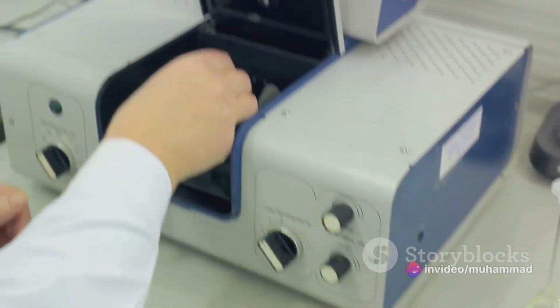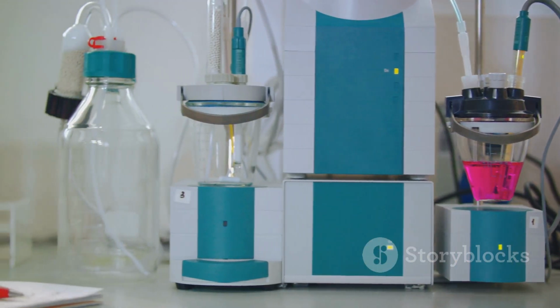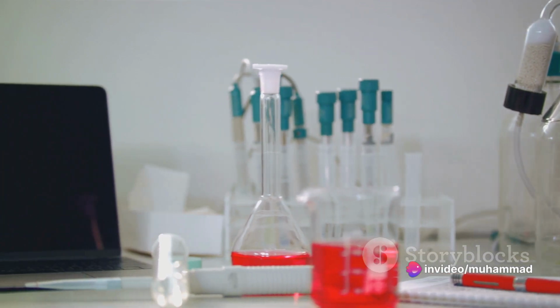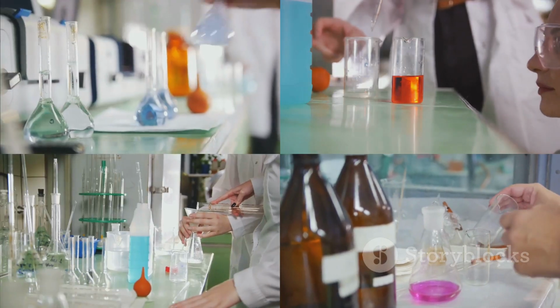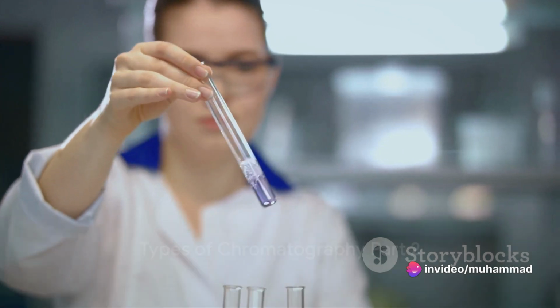But that's not all. The choice between liquid and gas chromatography also depends on the specific needs of the analysis, such as sensitivity, resolution, and speed. In some cases, one method may be superior, while in others, the opposite may be true. Next, we'll move on to some other types of chromatography that might surprise you. Continuing from where we left off, let's uncover more types of chromatography.